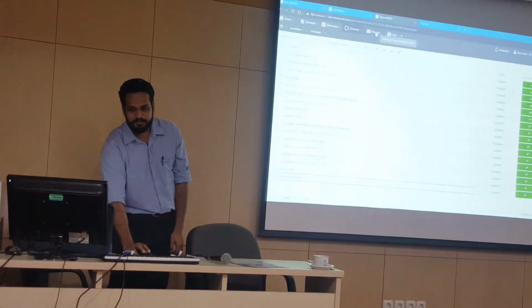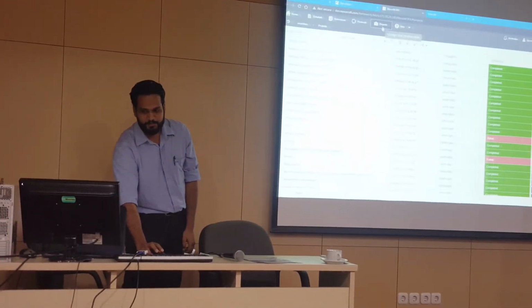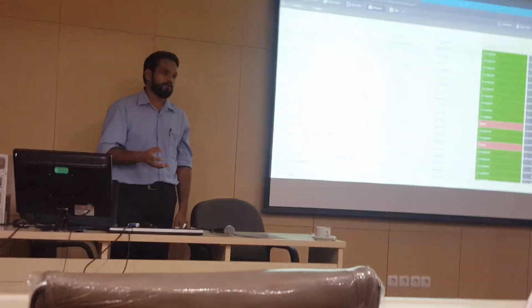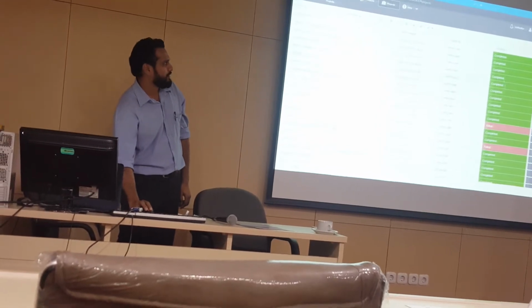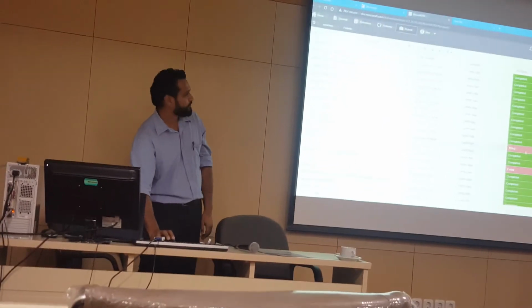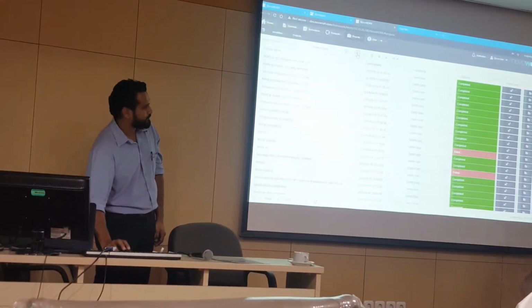So the next step is creating a project. When you go to your projects tab, you'll have a list of all the projects that you have previously run or are currently running. And you will be shown the status here. The status is all here, whether it's completed, whether it's killed, whether it's failed, or whether it's running. So you can just click on create new project.